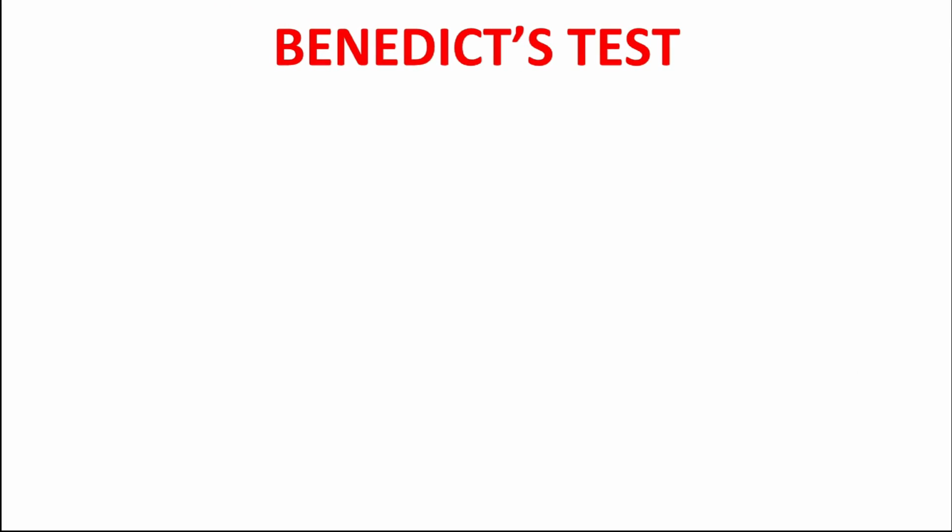Let's talk about the Benedict test. This test is specific for reducing carbohydrates, carbohydrates which have free aldehyde or ketone groups. They have the ability to reduce the solutions of various metallic ions. Here we will require Benedict's reagent.